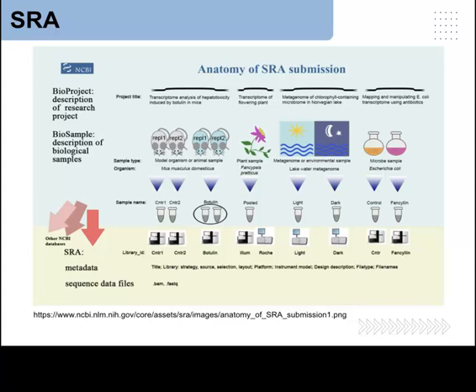So in this illustration, for example, we can see that there are different sequencing libraries that were prepared, right? So this one versus the one over here.